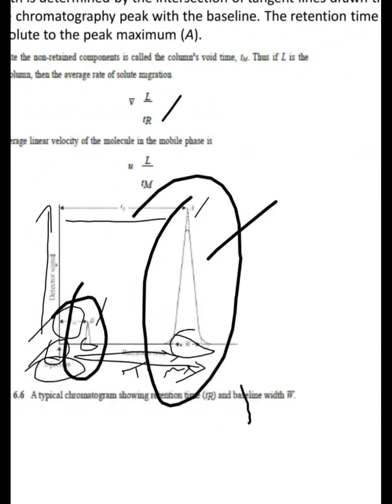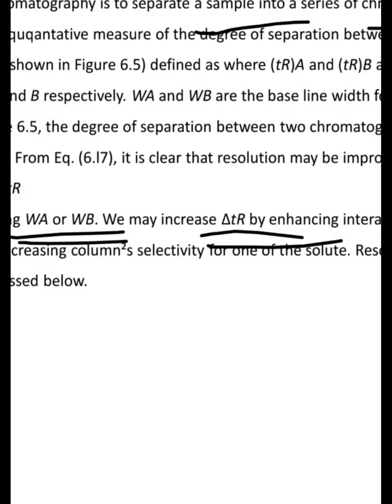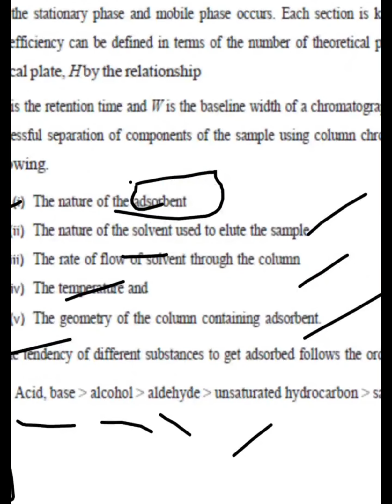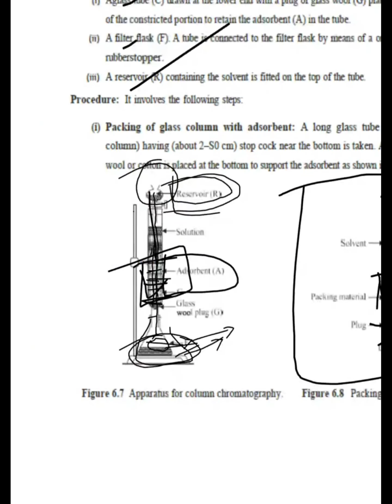The sample can be determined using the Rf, retention factor. Different compounds will have different retention factors. There are standard values for the different compounds. On seeing that Rf value, we are going to determine which compound is present in the given mixture.